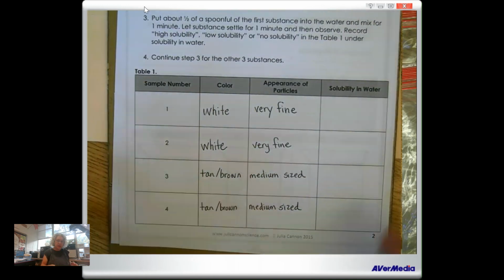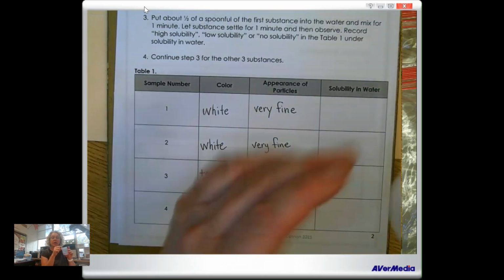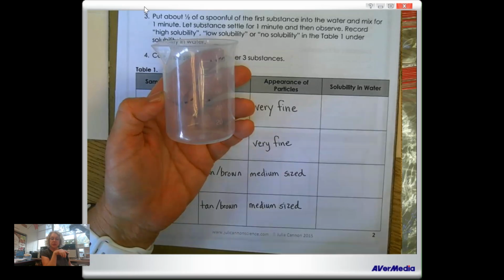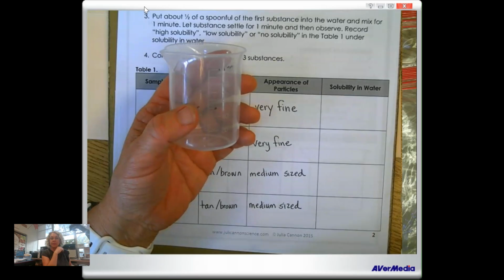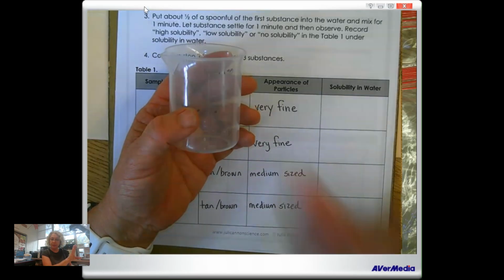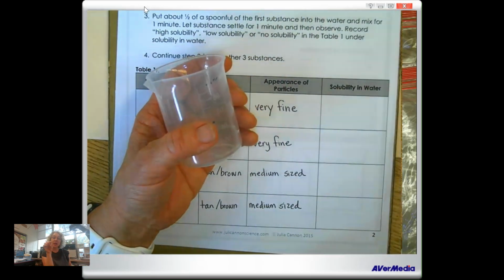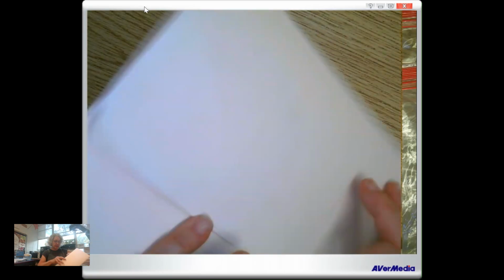Solubility in water. So what we're going to do is add 100 milliliters of water to each cup. 100 milliliters. And then we're going to stir, stir, stir. And we're going to see if they resemble the clear cup at the first lesson we did, or the middle one with the low solubility, or the one that had a lot of sediment with no solubility. All right, so let's go. I'm going to move my notes over. I think I'll leave this out. This might help us determine.